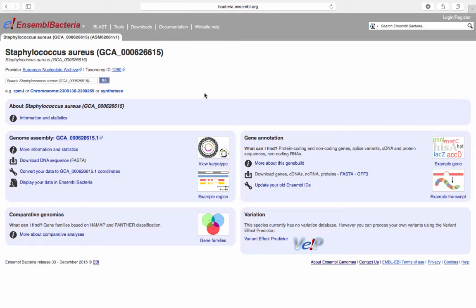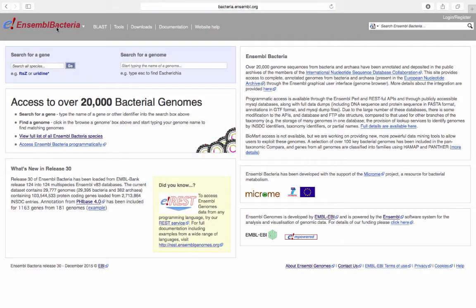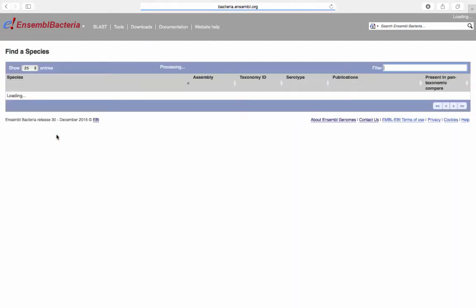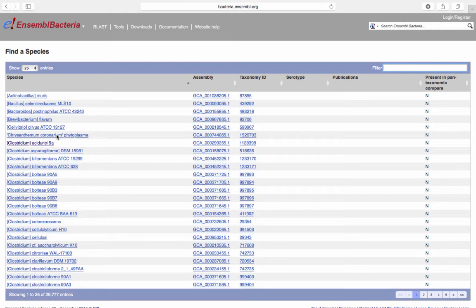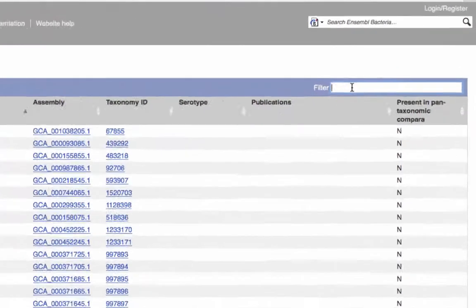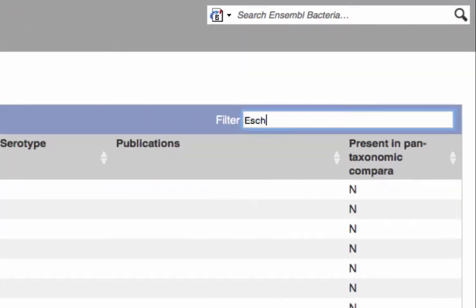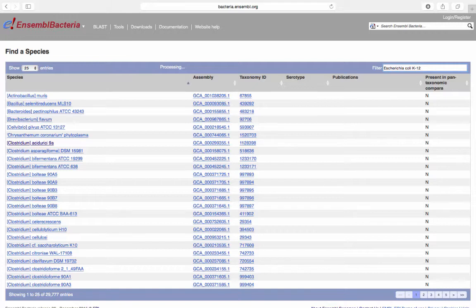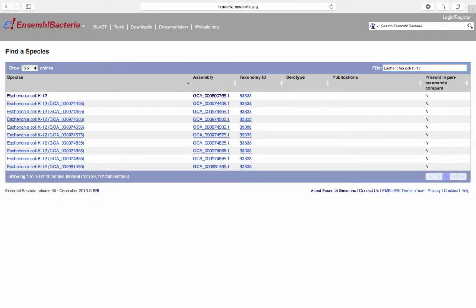You can also search and filter all of the bacterial species. Navigate to the Ensembl bacteria homepage by clicking on the Ensembl bacteria logo in the top left-hand corner of your screen. Click Full list of Ensembl bacteria species. Here, you are able to filter all Ensembl bacteria based on species name, assembly and taxonomy ID. We will search for Escherichia coli K12 by typing the bacterial name in the filter box. Press Enter. Clicking on the species name takes us to the species-specific homepage.